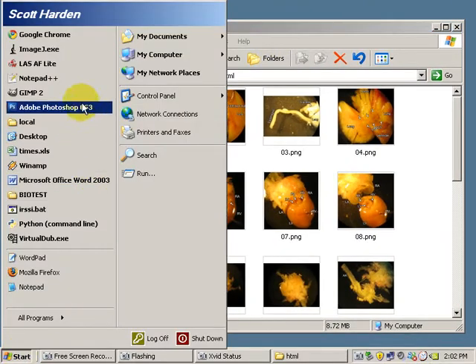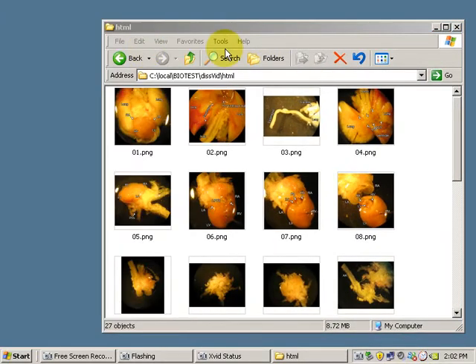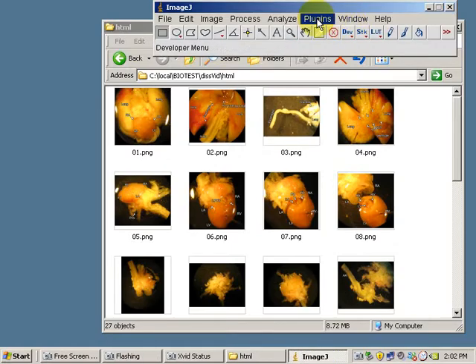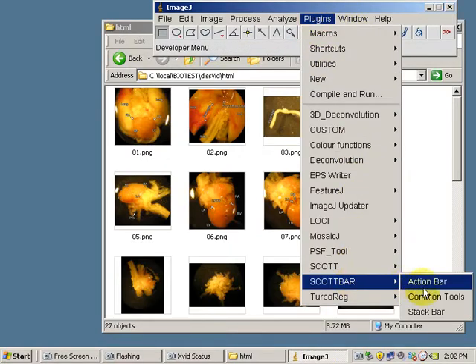First, I will open ImageJ, and I can go to Plugins, Scott Bar, and Common Tools.